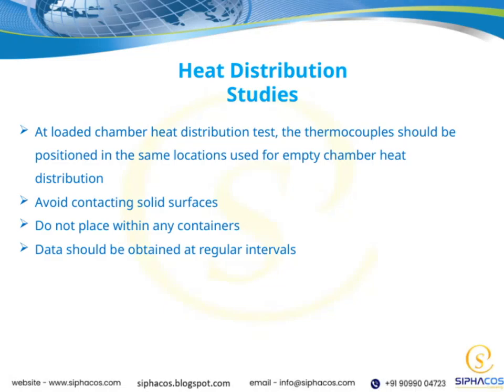When conducting the loaded chamber heat distribution test, it's important to position the thermocouples in the same locations we used for the empty chamber test. This consistency helps us accurately compare how heat distributes under different conditions. Remember, avoid contacting any solid surfaces with the thermocouples, as that can affect the readings. Also, do not place them inside any containers, since that could alter the heat flow and skew our data. It's crucial to obtain data at regular intervals throughout the test. Consistent timing ensures we capture the heat distribution pattern accurately over time.